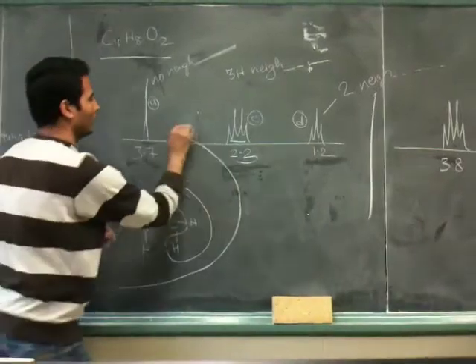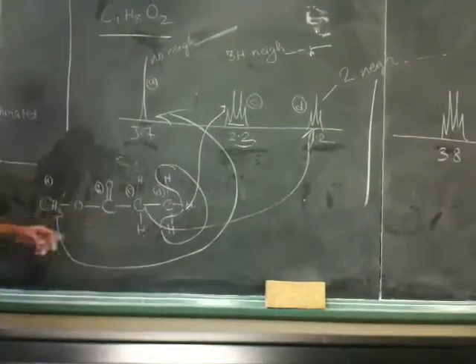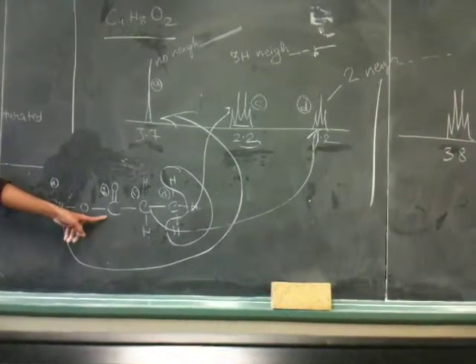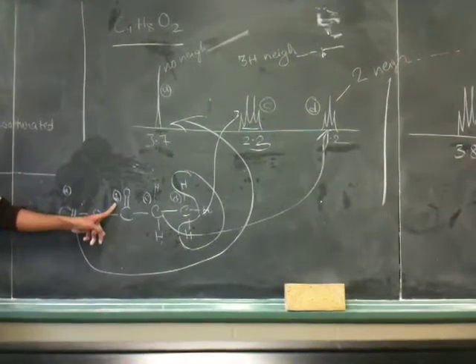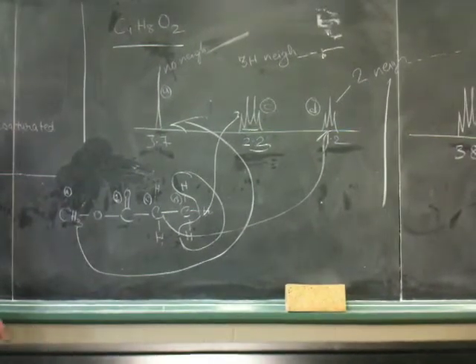Please don't ask, where's B? B has no protons, so there is no spectrum for B.